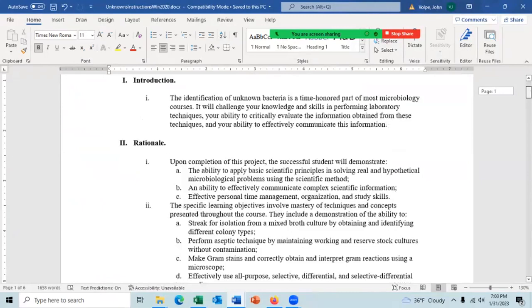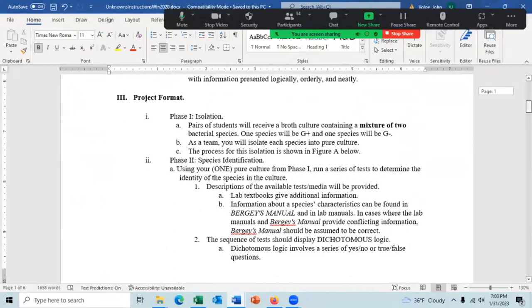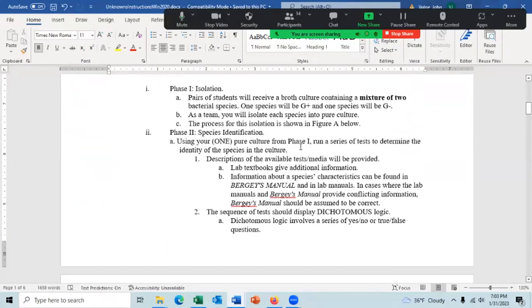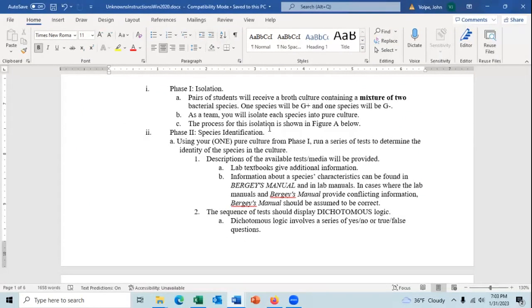All right, you can read about the introduction and the rationale. Let me talk about the project format. You don't really have to isolate the bacteria. When you went into the lab, I would give you a culture that had 2 bacteria species in it, and you'd have to streak it out and get a pure culture. We decided in the online course that we're just going to give you one unknown number.